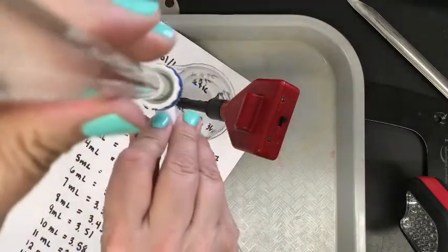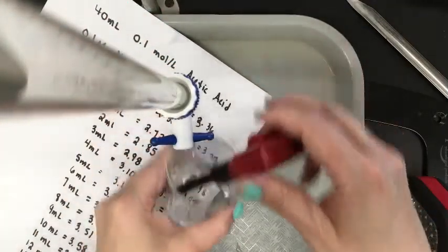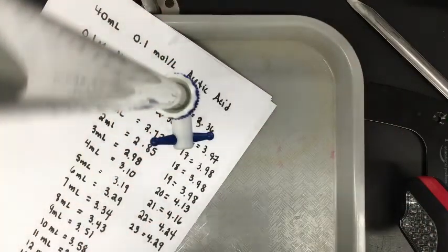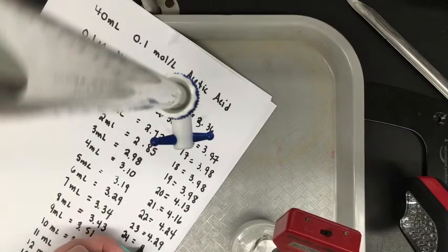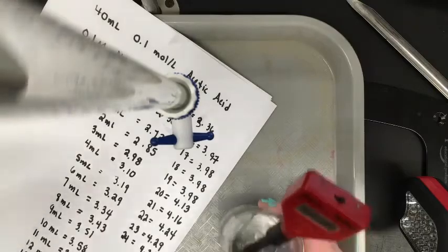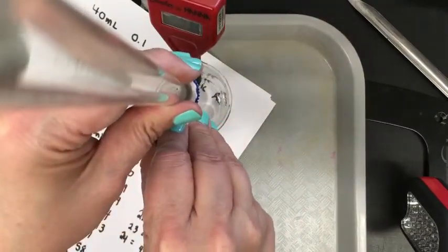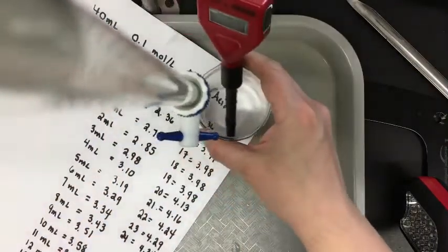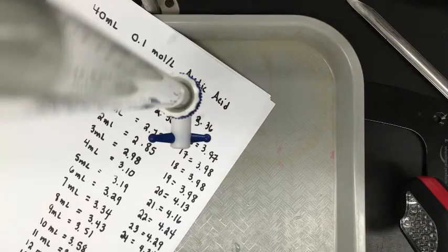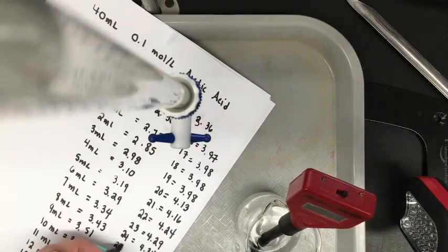Now we'll add another. So we're at 24, we're at 4.34. There we go. At the next one, at 25, we're at 4.39.